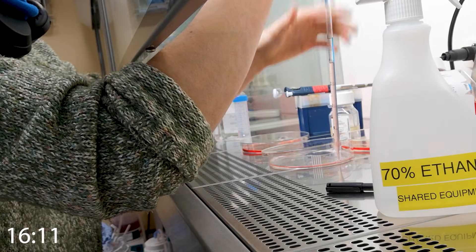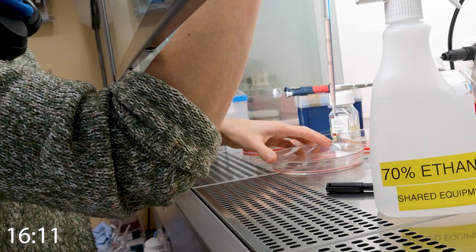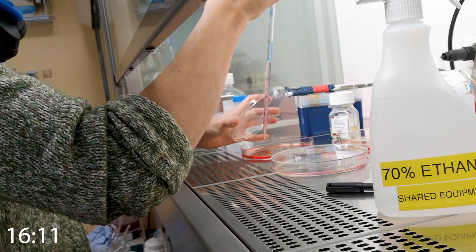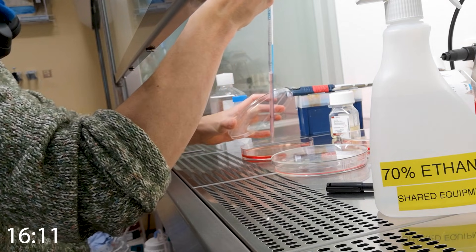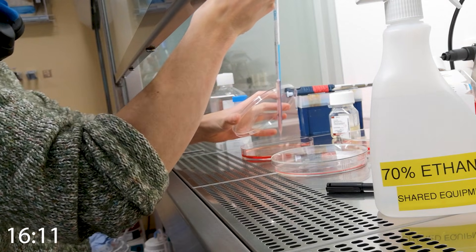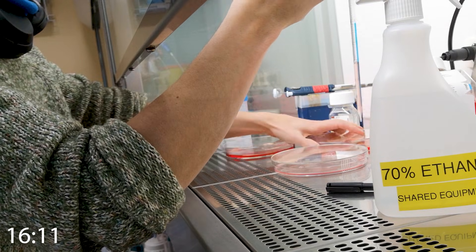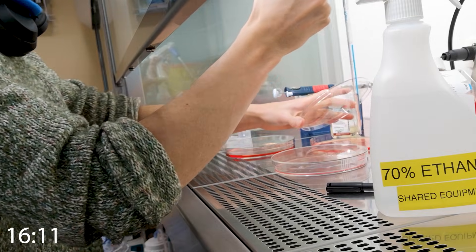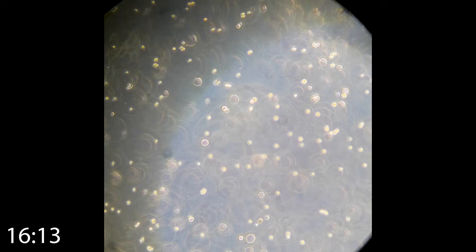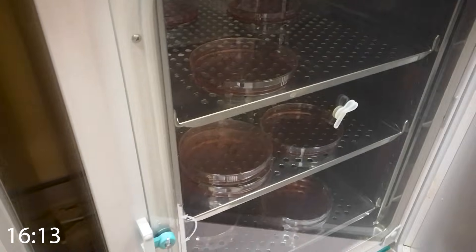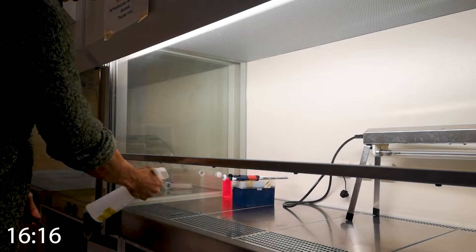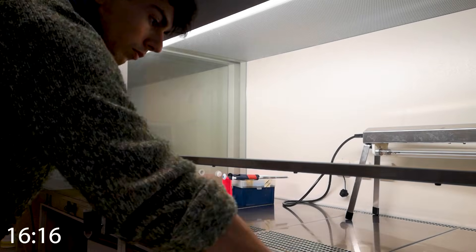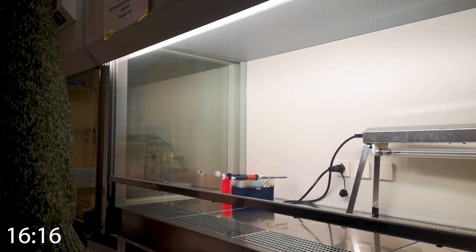I then suck up the cells and put them into two new dishes with fresh growth medium. The growth medium is like food for the cancer cells, and from my understanding, it's made from blended cow fetuses, so it's like the least vegan thing I've ever come across. But if I don't do this every two to three days, then my cancer cells would die, and I wouldn't get a degree, and then I'd be sad. Anyway, my cells look good and I put them back in the incubator. And I need to make sure to sanitize the fume hood or I might contaminate my cells, which my inferior lab partner Peter managed to do a few weeks ago.